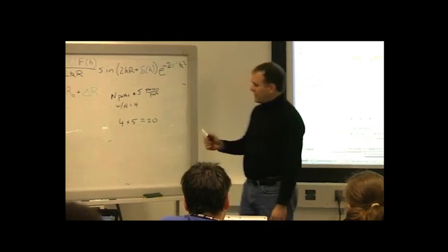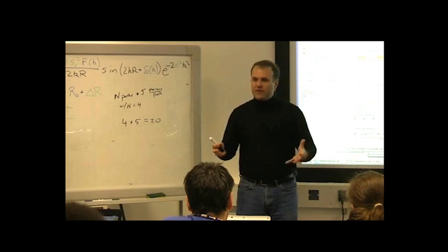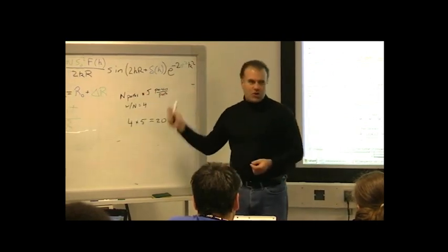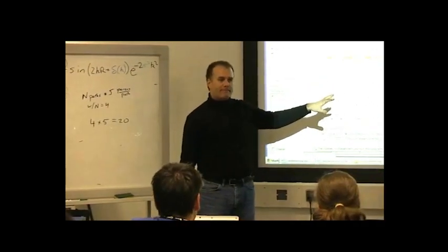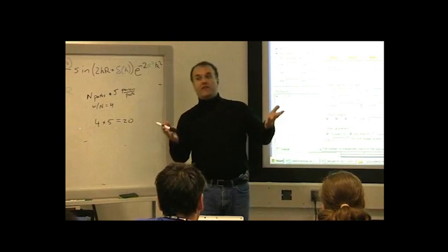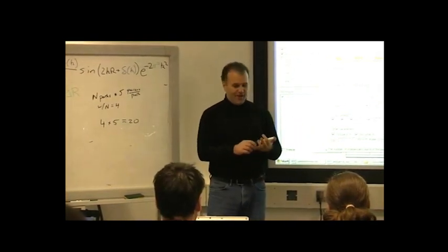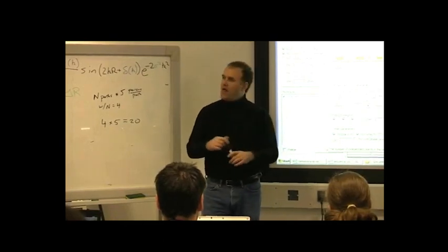It would seem as though we are numerically and statistically incapable of evaluating all of the green terms for all of the paths used in the fit. This isn't the end of the story. This isn't a disaster. We have ways of dealing with this. And the way that we deal with it is this.